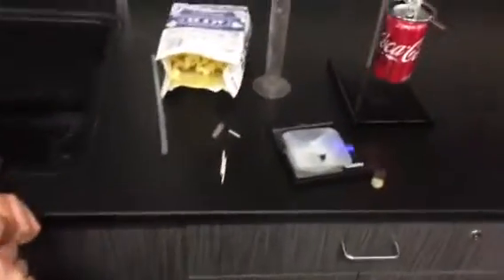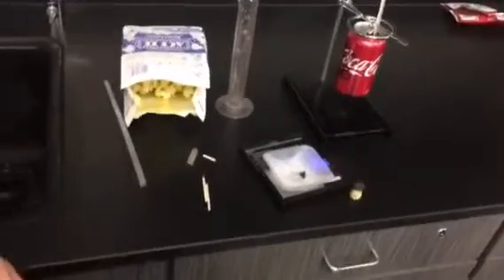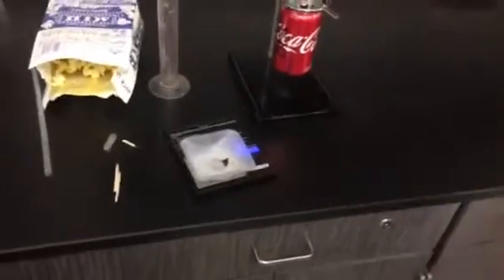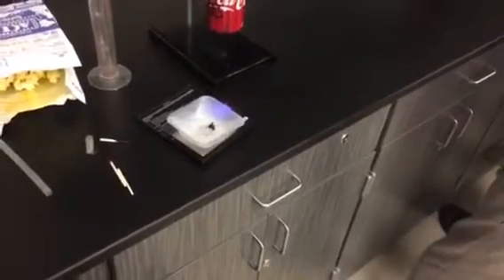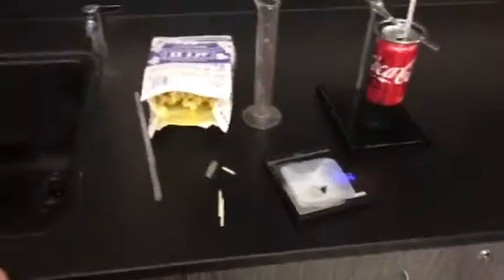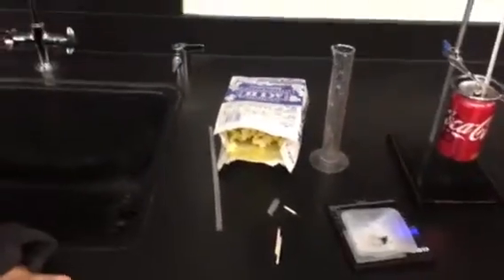So we're basically gonna do the same thing again. We're gonna turn it off and set everything up. That was already burnt. It burned a little bit, but if you got yours to burn a little bit, then we add it in. How long does it keep the thing burning? So we're doing trial 2, right? All right, trial 2. On to trial 2.